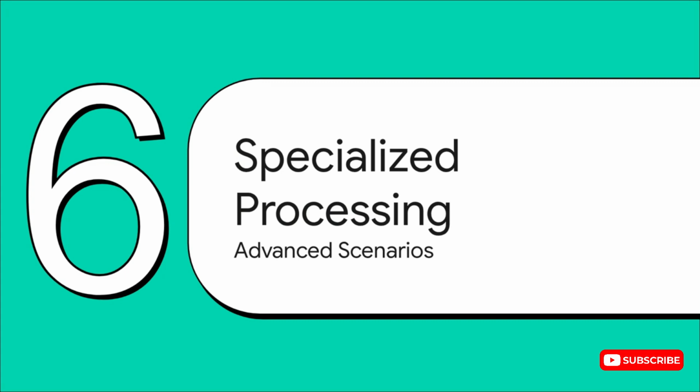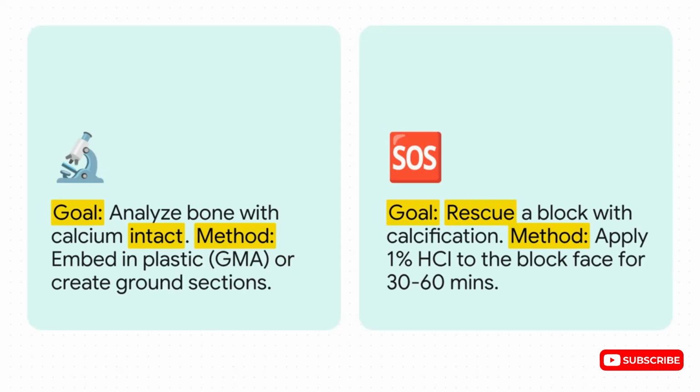All right, to wrap things up, let's just touch on two pretty specialized scenarios. What to do when you intentionally don't want to decalcify a bone, and how to rescue a block when you find unexpected calcium on the microtome. So let's look at these two advanced approaches.